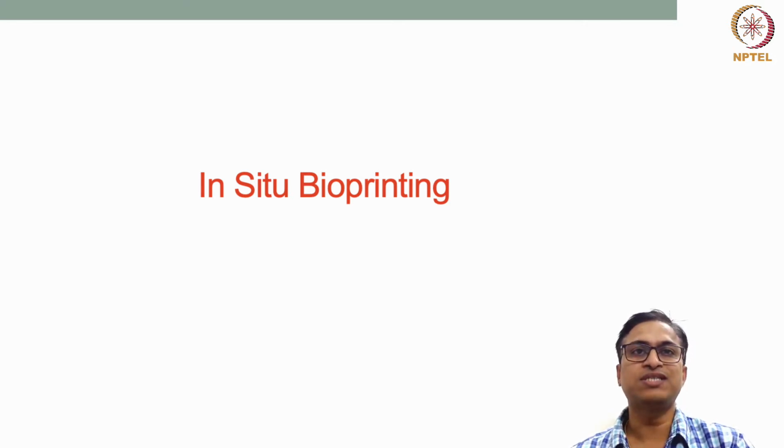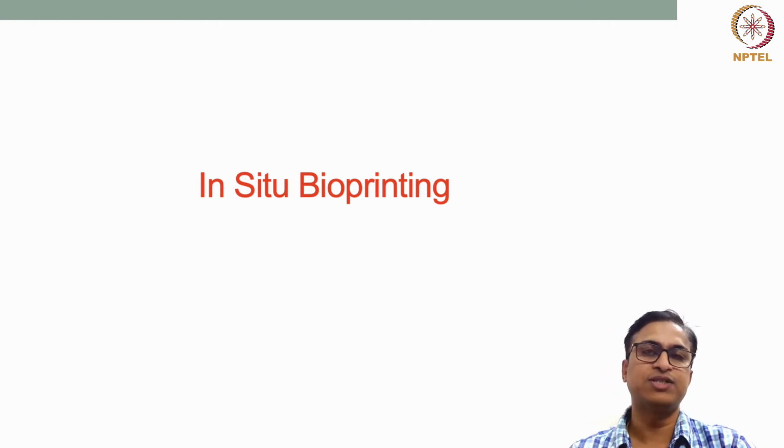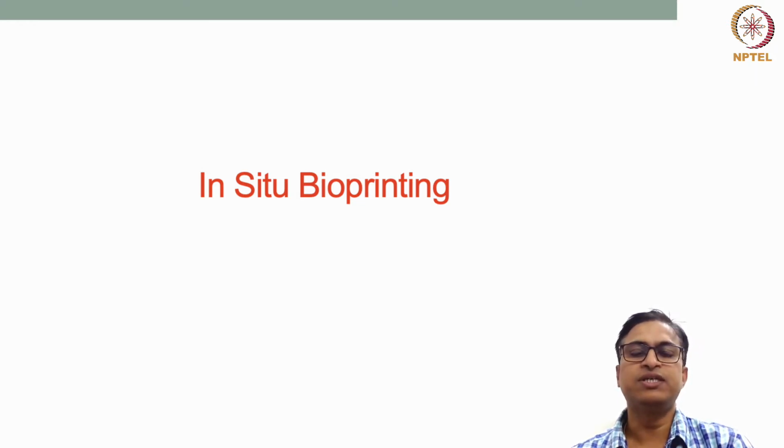So this process involves depositing, as you have already discussed, either inkjet printing, extrusion bioprinting, or laser-assisted bioprinting to deposit cells plus matrix materials directly on the patient's wound bed.